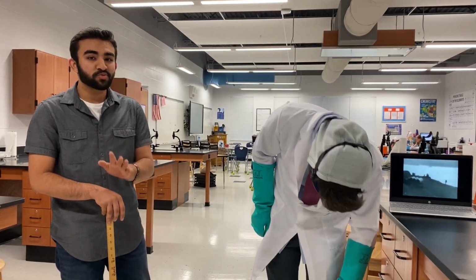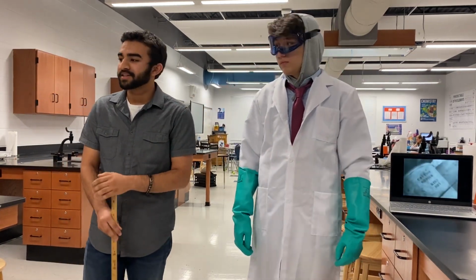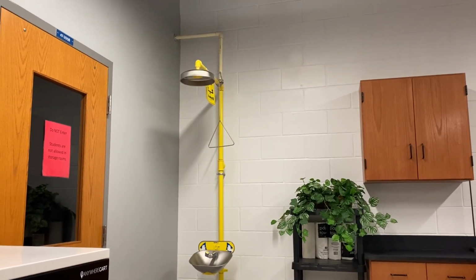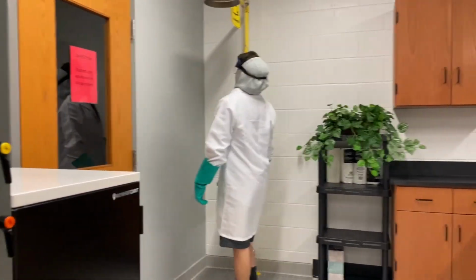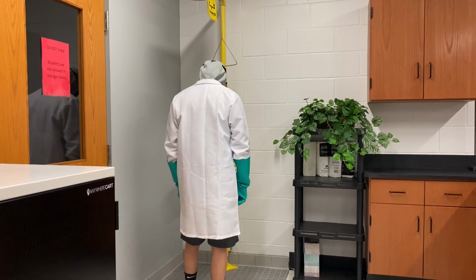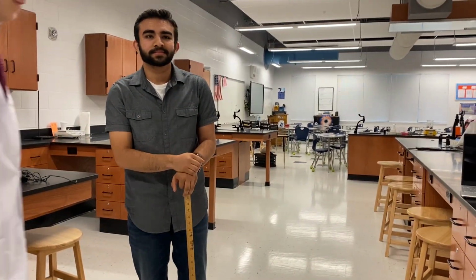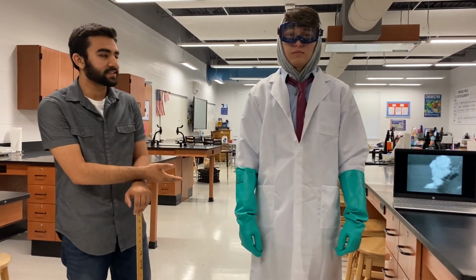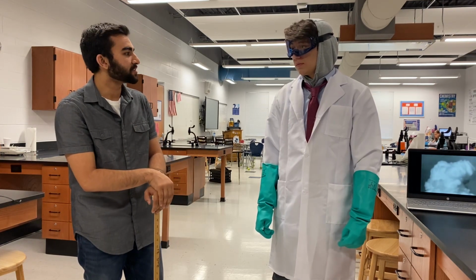And in case of a true emergency, and if any of this fails completely, the best option would be to go to an eye wash station or a shower, in which a jet stream of water would be coming down on you and would assist you in your emergency situation. Alright, so that would wrap up this section of the video. This is the ideal form when it comes to what you want to look like in the lab situation.